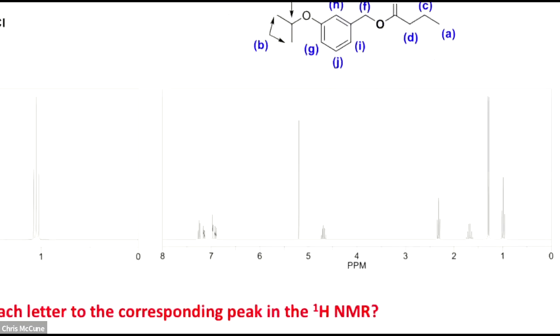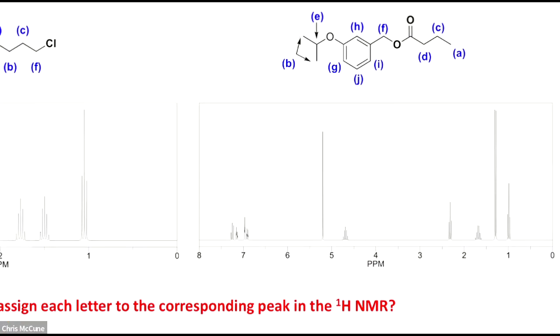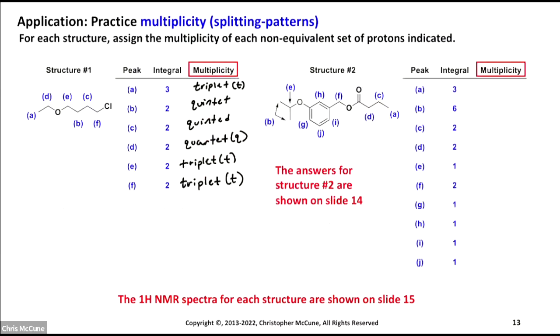I've also shown the NMR spectra for structure 2, so you can compare what you determined in this problem to see if you're right. Okay, and so that'll give you a way to check your work as you go as well.